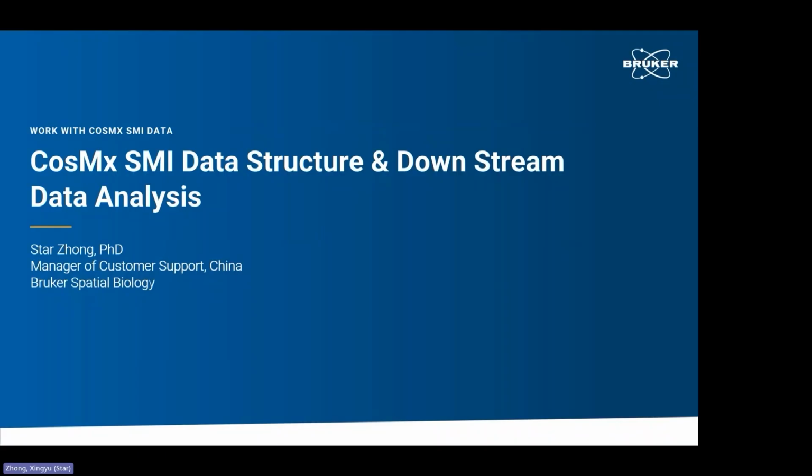At the beginning of March, we launched the CosMx SMI data analysis webinar, which covers both the basic data analysis and also some advanced data analysis. Today is the first session of advanced data analysis.